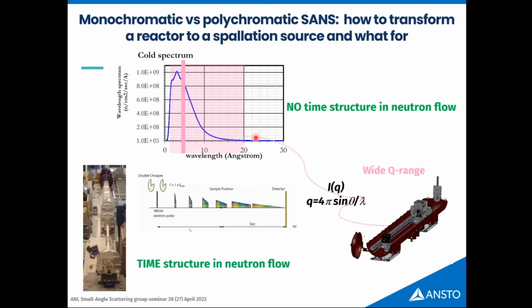So to know what those ones are, somewhere in the chopper system we have a point which we define as the origin of time. Not going to go into details now, but the point is we know where time of flight starts, and then we measure the time of arrival at the neutron detector. This is how we're doing this. So once we know time, we know the velocity. Once we know velocity, we know the energy or wavelength.